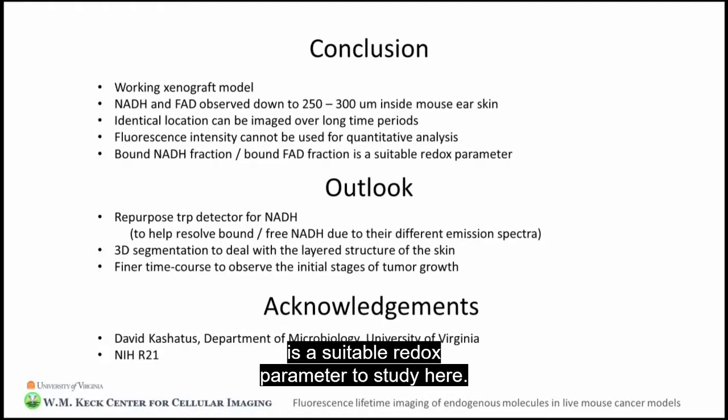What to do maybe in the future? Because we really don't need the UV detector to detect the tryptophan because we can't see it, and it's not really very clever to use lifetime for detecting second harmonic because we can use any other detector for that.